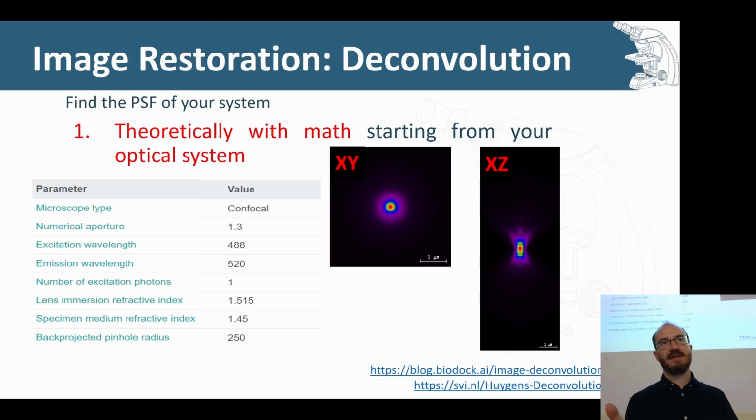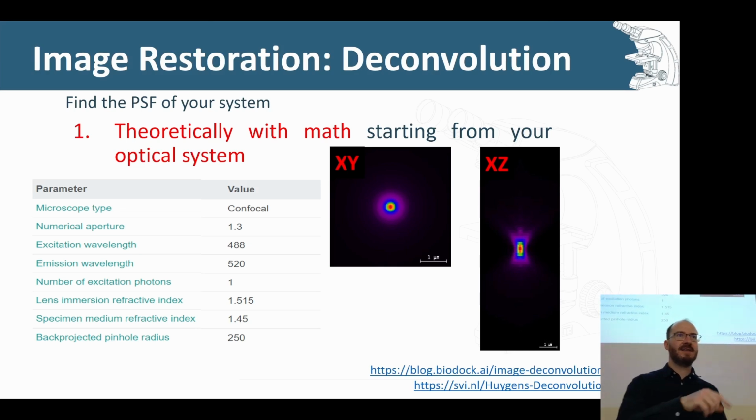So if there's a range of emission, you have to say, okay, where is the peak, because usually they show you there's a peak in this range, and then you try to use that peak. Otherwise, if you don't know what the peak is, then you just say, okay, let's just split the difference. It's in this range, let's just choose the middle value. But yeah, you need to set up the point spread function specifically for the emission wavelength. Then I'll demonstrate that now with an example.